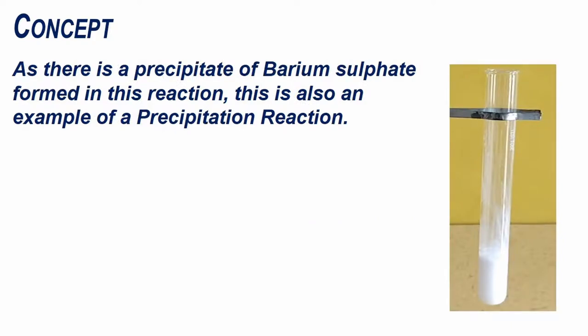As there is a precipitate of barium sulphate formed in this reaction, this is also an example of a precipitation reaction.